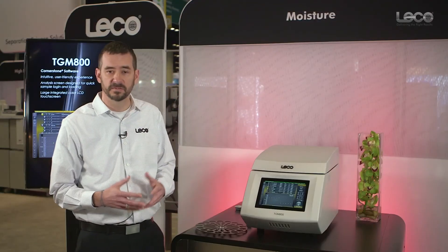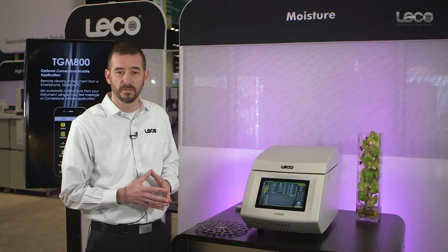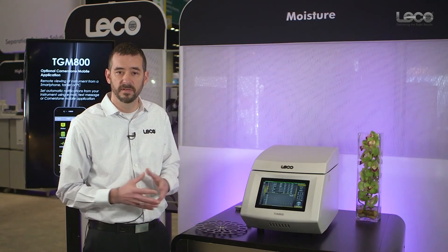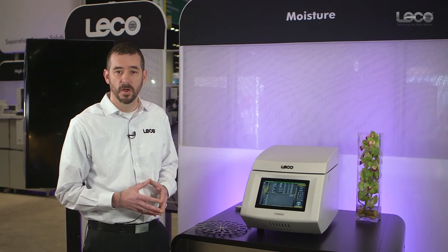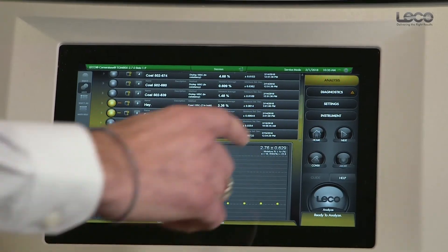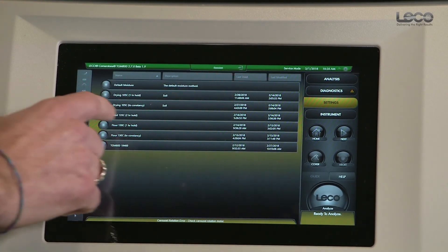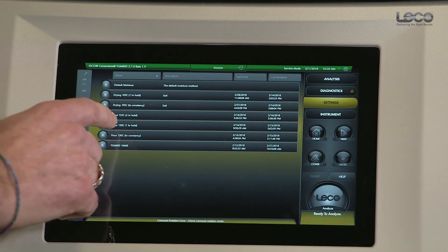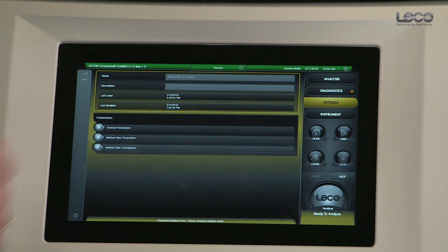The TGM has very flexible method settings. Our goal is to allow operators to define a method tailored to their needs — either for their moisture application or to replicate results from manual methods. Going into settings and methods, you can review a method and its parameters.